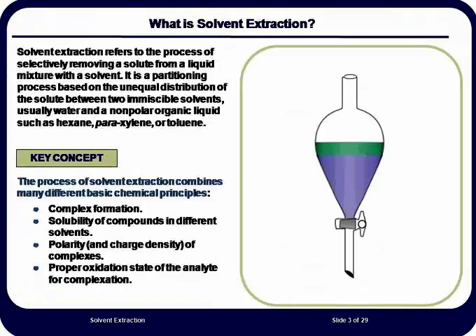separating the 2 solvents. However, as the 2 liquids are vigorously shaken, the solvents become intimately dispersed in each other. The dispersal is in the form of droplets. The more vigorous the shaking, the smaller the droplets will be. The smaller the droplets are, the more surface area there is between the 2 solvents. The more surface area between the 2 solvents, the smaller the linear distance will be that the molecules will have to travel to reach the other solvent and migrate into it. The shorter the linear distance traveled by the molecules, the more rapid will be the extraction.